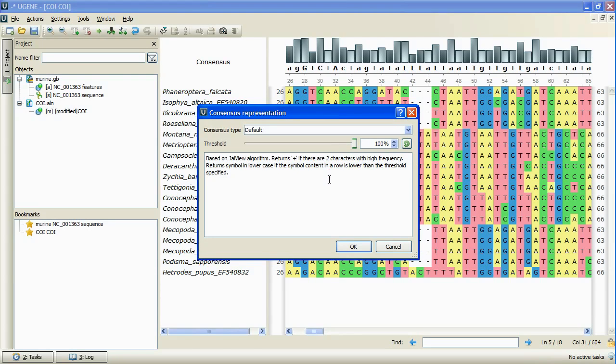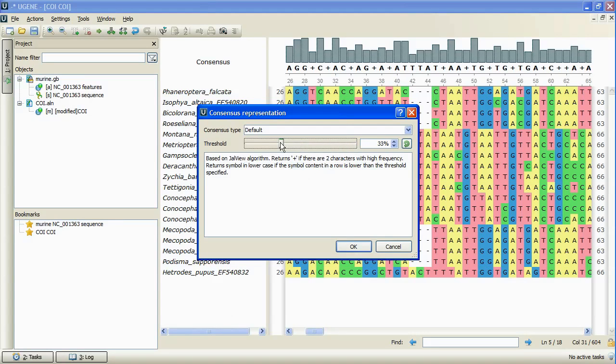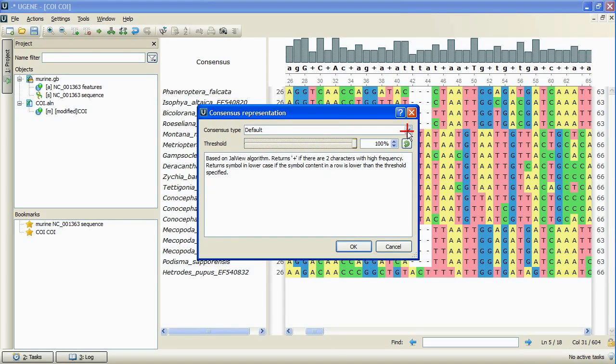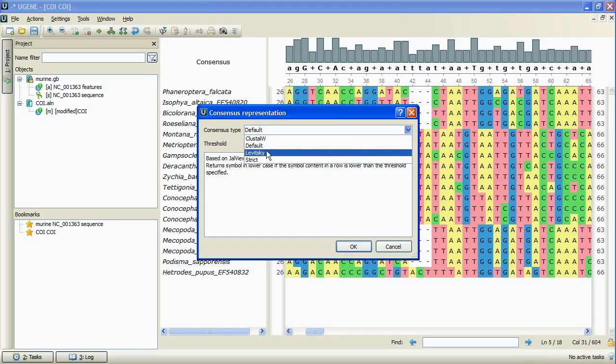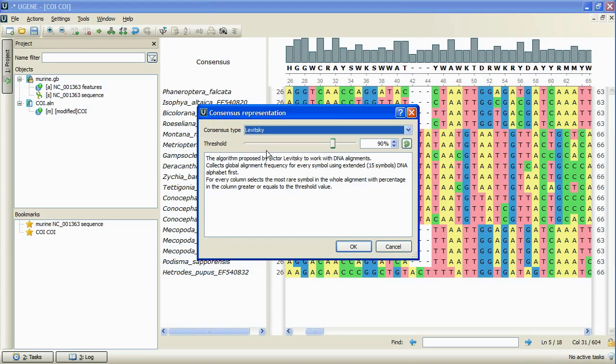Also, we can specify the consensus representation scheme by moving the threshold slider. It is nice to mention that one of the consensus types was developed by one of our users, Viktor Levitsky.